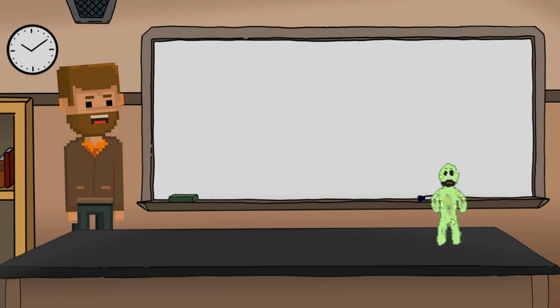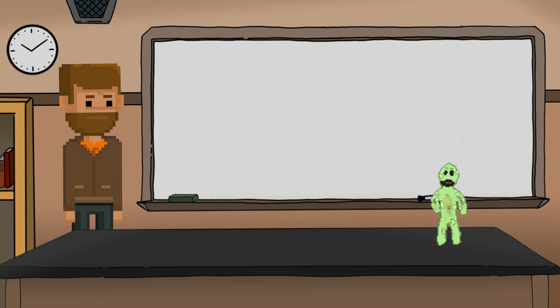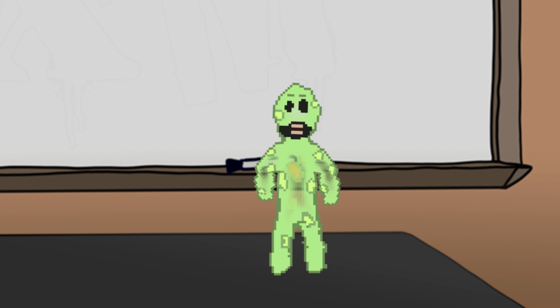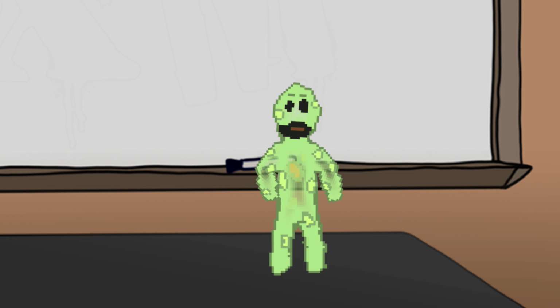In today's video, we're going to talk about your first unknown. Unknowns might seem a little scary, but if you follow the steps we cover today, you won't have a problem. The main idea behind an unknown is to see if you have acquired all the laboratory skills necessary to solve a problem on your own. That is, to find the identity of an unknown microorganism. This is a primary skill you will use in your profession as a scientist. For example, collecting a patient's throat swab and sorting out what ails them.